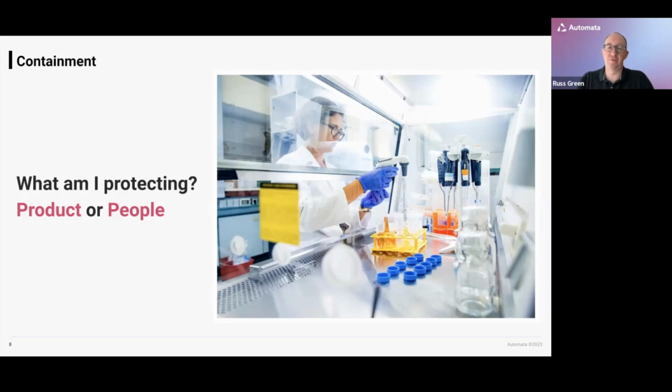But I would also ask us to question, when we think about automation, whether we need that level of containment, because immediately it constrains the kind of system we can build in some form. And so we always have to ask that question about what am I protecting here? And is my product actually safe? Do I just want to keep it sterile, or is my product, by which I mean my cells that I'm culturing or what they're producing, hazardous in some way, in which case I do need to also protect my people. And right now we have an awful lot of conversations where people default to the statement, well, it must be the same level of containment that I'm using in the lab, and then actually with further explanation, perhaps it doesn't need to be.